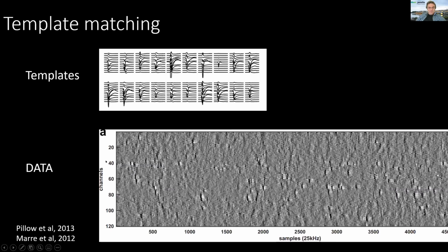We take them, we slide them over the data left to right, convolutionally in time, and we detect time points where one or more of these templates are high, and we subtract off the events at those time points. So let's say we detected some big events here with our templates. We subtract off a scaled version of those templates so that we try to make the residual as clean as possible, right? There's nothing left there.